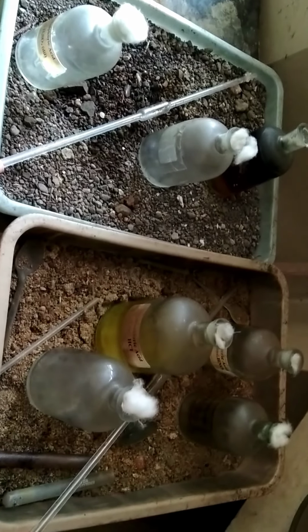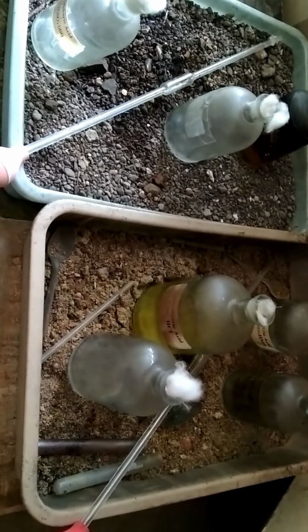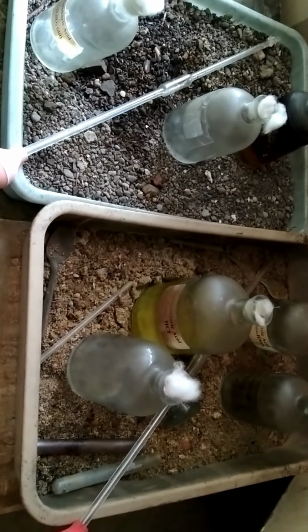The concentrated acids like HNO3, HCl, H2SO4 are very important in the analysis. These concentrated acids are always kept in sand baths, in sand, and carefully handled, generally wearing hand gloves. But if you do not handle them with hand gloves, you can use droppers and pipettes for that.